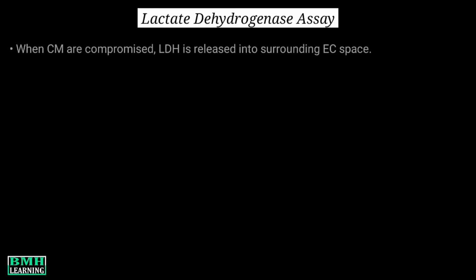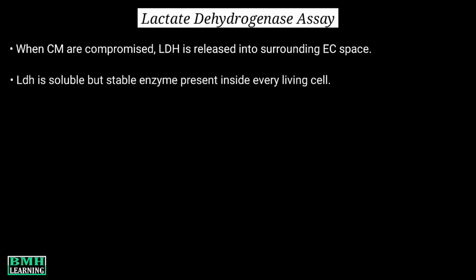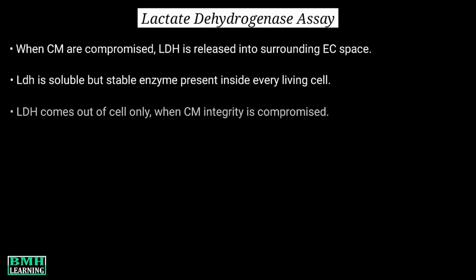This video is about lactate dehydrogenase assay. When the cell membranes are compromised, or you can say damaged, lactate dehydrogenase is released into the surrounding extracellular space. LDH is a soluble but stable enzyme present inside every living cell. Now, the only way for the LDH to come out of the cell is when the cell membrane integrity is compromised.